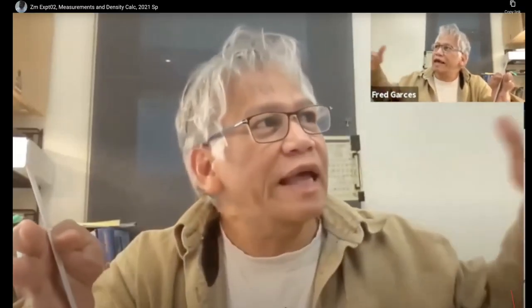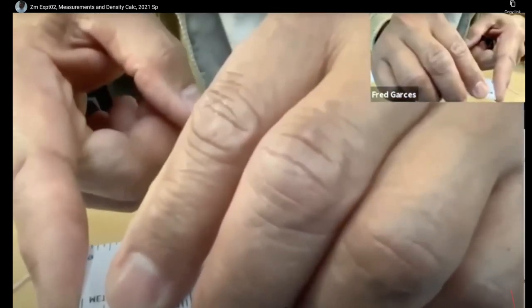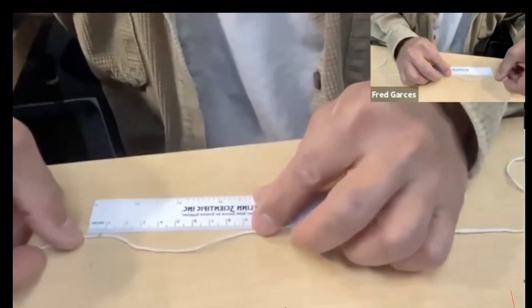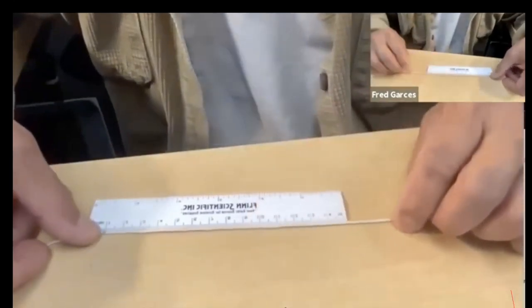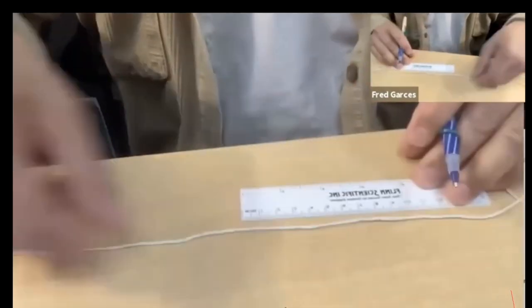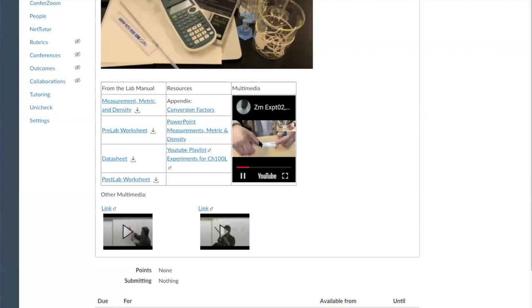Here I am, showing you how to read the ruler and how to do the experiment. Measure to the 1 centimeter and then mark 15. But really, when I mark this 15, that's actually 14, and then do the same thing here. I don't want to listen to myself, so let's stop this from talking. This was the most recent one, and then these are old ones. It is basically the pre-lab discussion for my class. It tells you about how to read measuring devices correctly and how to round off. So these are the resources available.